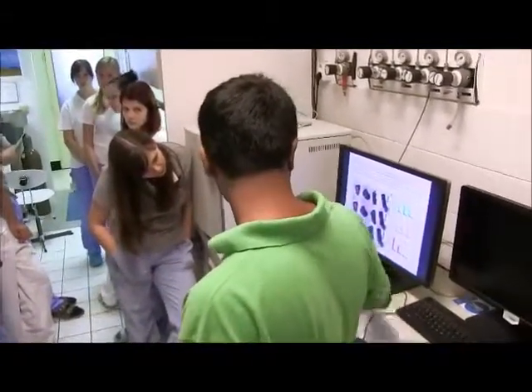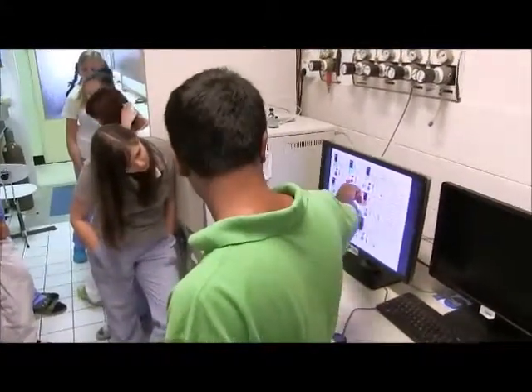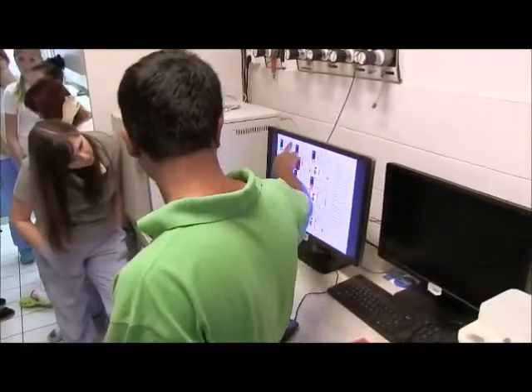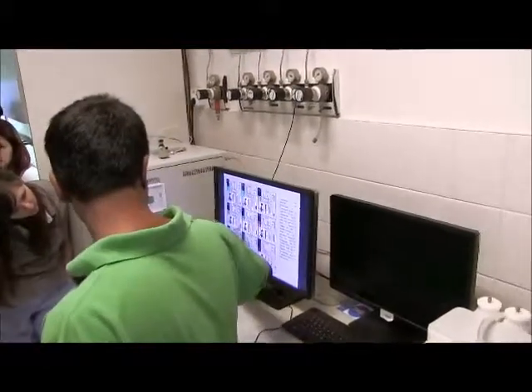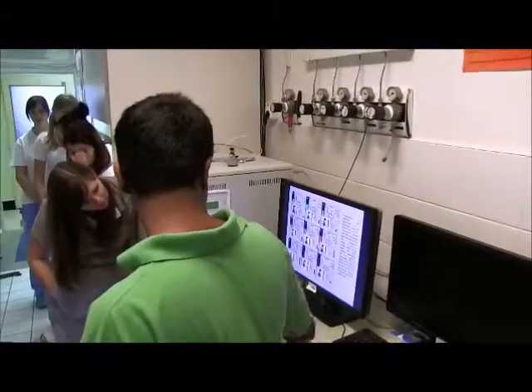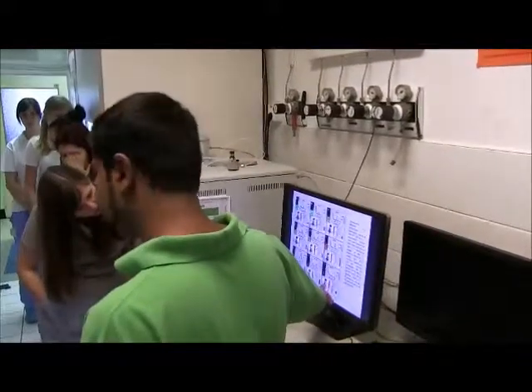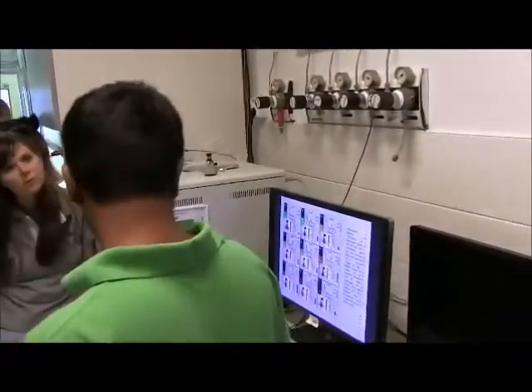Here is the fluorescence under the tissue. We use chicken tissues, and here we inject the chicken embryo with different types of quantum dots that are shown in this inset. For example, here we cannot find good fluorescence by photograph, but when we apply it on the chicken tissue, we find it has not bad fluorescence.